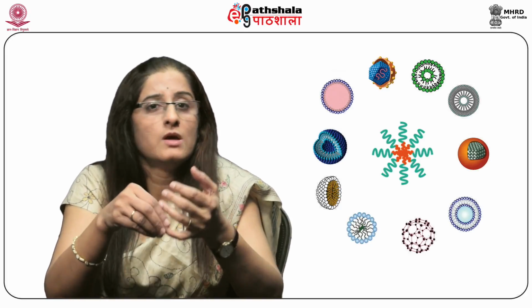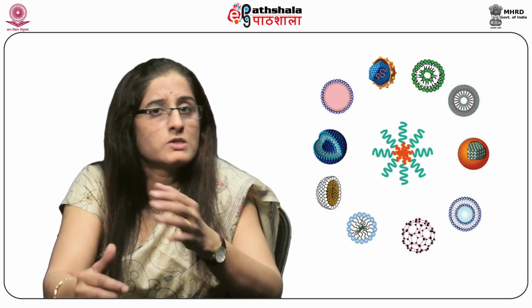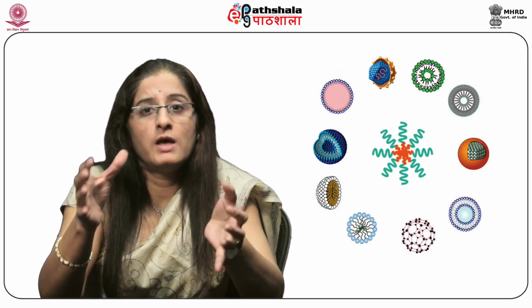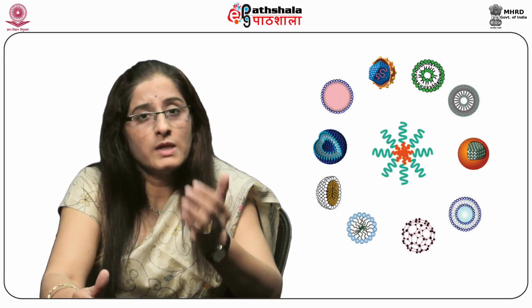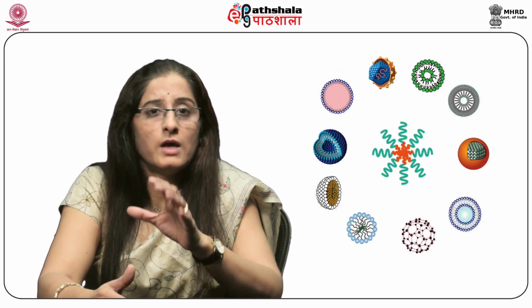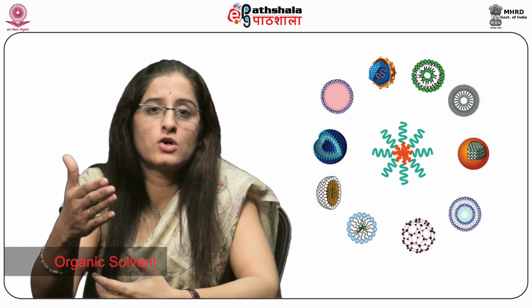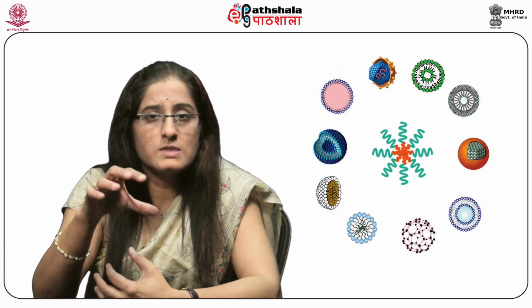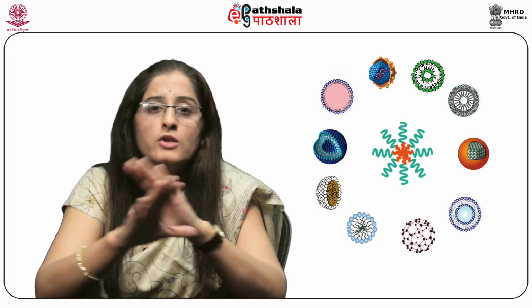method. First, the main step in this method is the formation of the lipid film. If the film is not thin and uniform, then the liposomes will either be very large and having several lamella or will not form at all. A thick and non-uniform lipid film will result in lumps and aggregated masses of lipids. During the evaporation of the organic solvent, the rotation of the vessel or round bottom flask must be consistent and continuous. So, it will lead to the formation of a very thin and uniform lipid film.